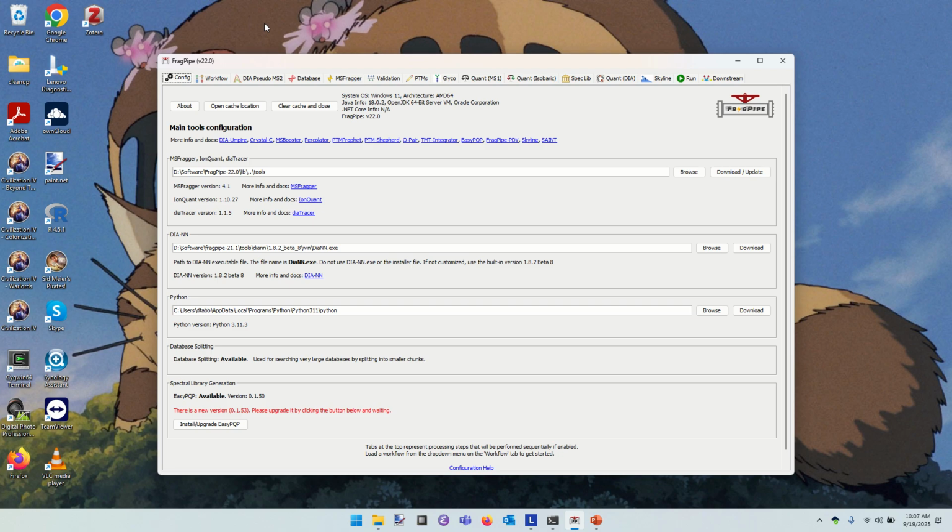DDA focuses the attention of tandem mass spectrometry on the peptides that are currently available coming off of the LC column at a given moment in time. A given proteomics experiment typically lasts something like 90 minutes. So it's often the case that you have what we call the shallow gradient, a shallow rise in hydrophobicity, causing the peptides to come off of the column and flow into the mass spec. So the instrument is choosing to sample what peptides create intense signals in MS scans and selecting those for fragmentation in tandem MS scans. So we're going to have essentially three processes that come into play for FragPipe to handle.